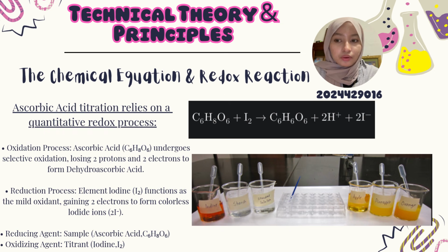Because the amount of iodine reacting is directly proportional to the amount of vitamin C present, this redox reaction can be used to quantitatively determine the concentration of ascorbic acid in the sample. The image shown here illustrates the color change observed during the titration process.